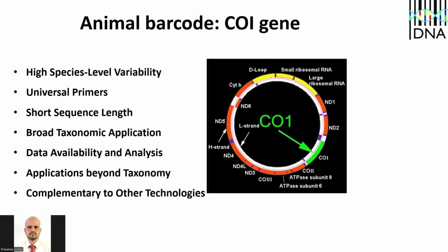They are short in length, just 600 base pairs. Anything less than 800 is okay, because Sanger sequencing and Taq polymerase have a fidelity issue. They cannot amplify continuously for more than 900 base pairs or so. So anything shorter is advantageous during PCR.